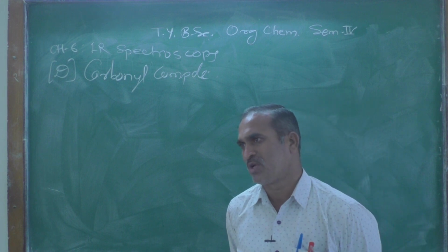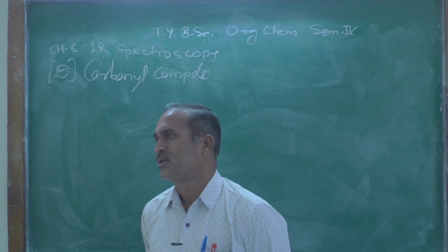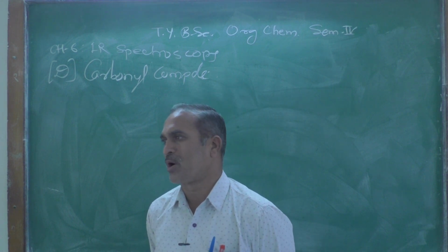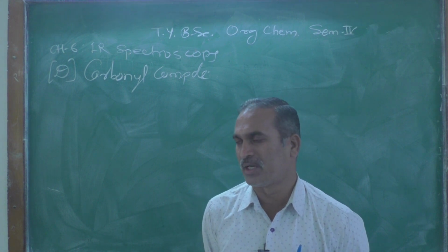When a carbonyl group is present, it gives a prominent peak near 1700 per centimeter.